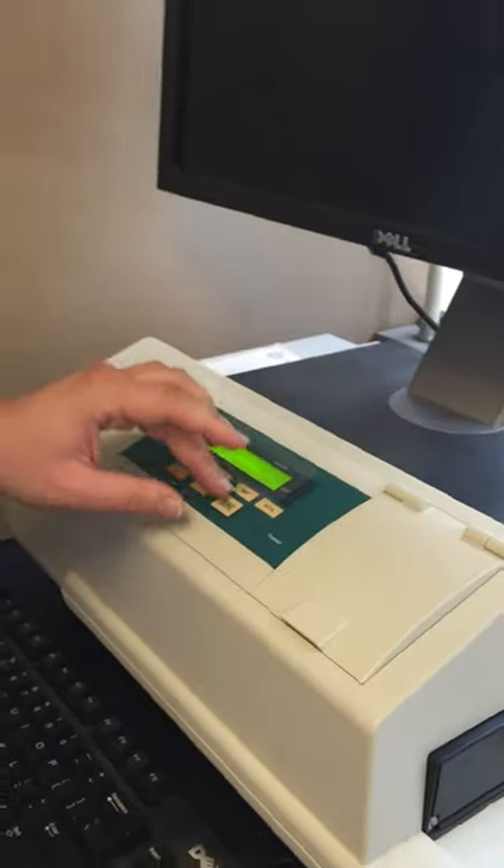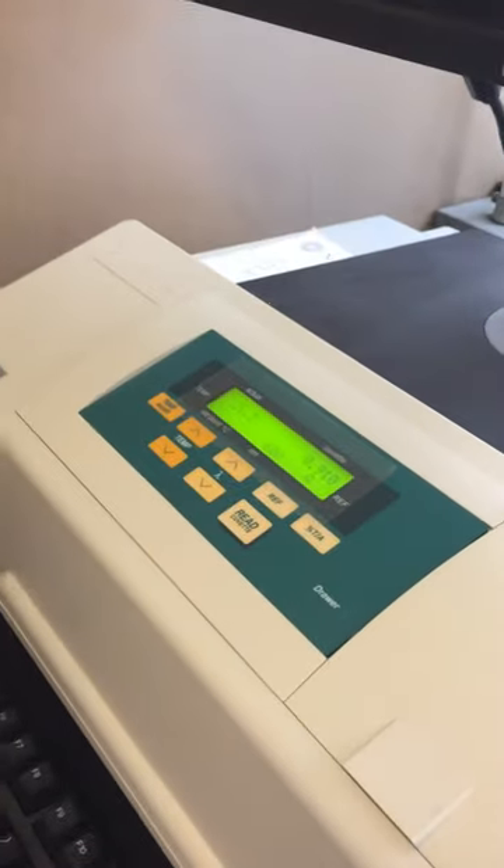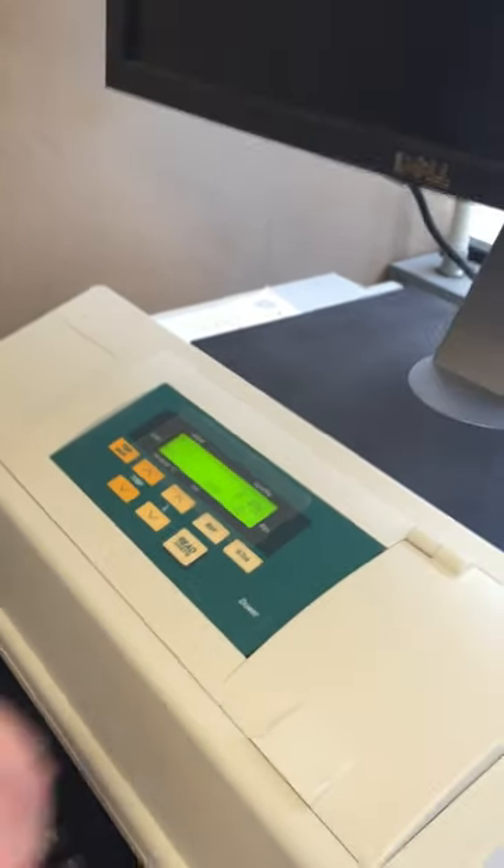When you press read here, it will shoot light through it and measure the scatter. And it's as simple as that.